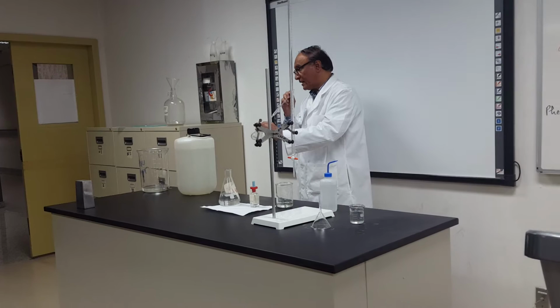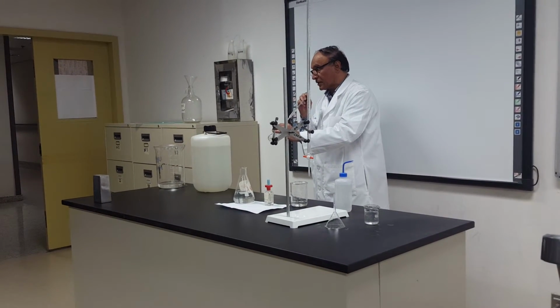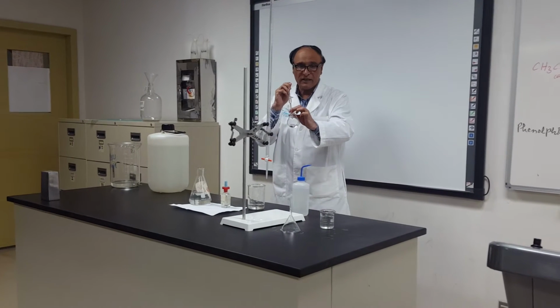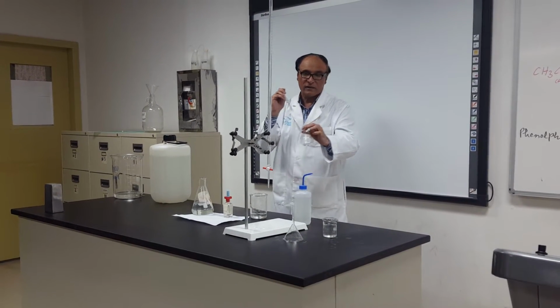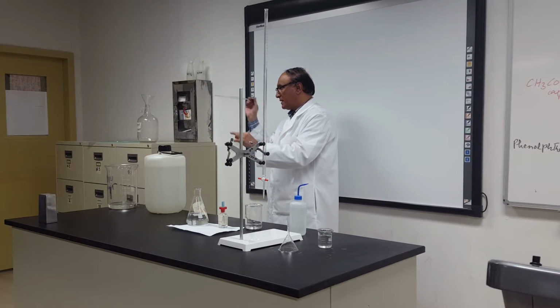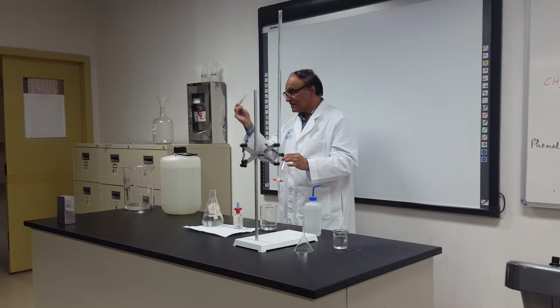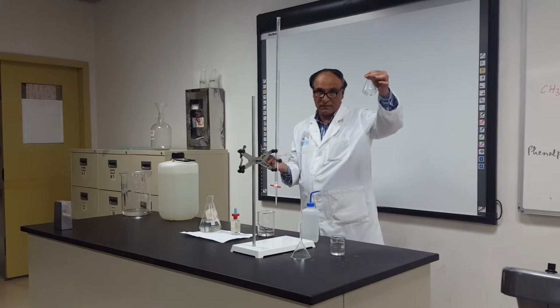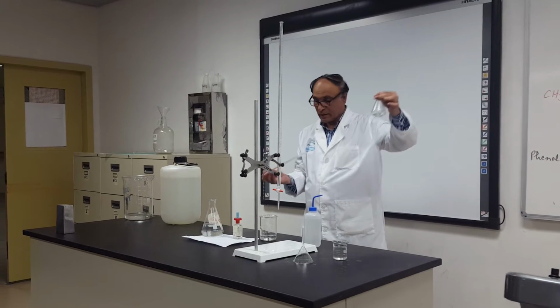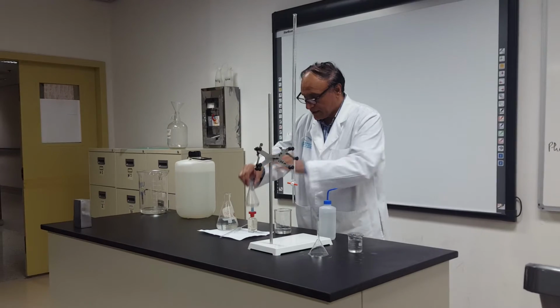Because if you blow it, that will blow. If someone sees that you are blowing it, you will understand that these are not the science student. And when it is finished, touch 2 times. 1, 2. There will be a drop here. Don't worry about the drop. This is designed like that. It is made like that, that this is exactly 10 milli. Okay. So this is exact 10 milli. And now this is ready.